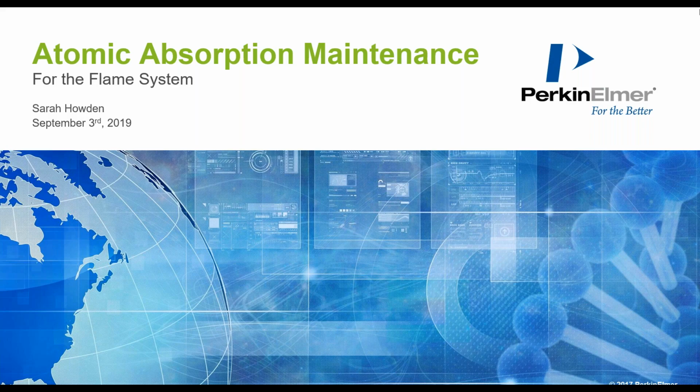First of all, I do recommend that someone in your lab is designated to be responsible for the equipment, because if no one is designated as being responsible, it's probably not going to be maintained.